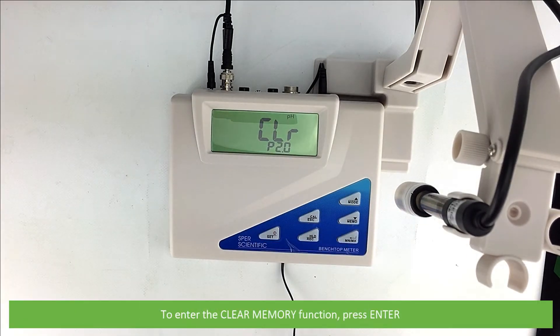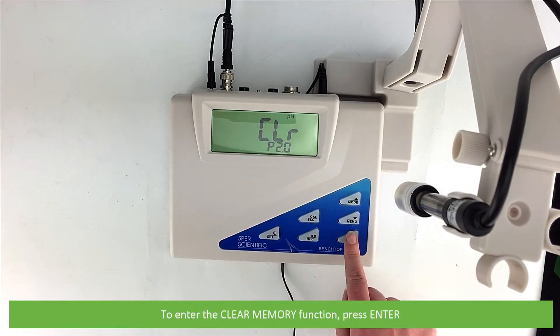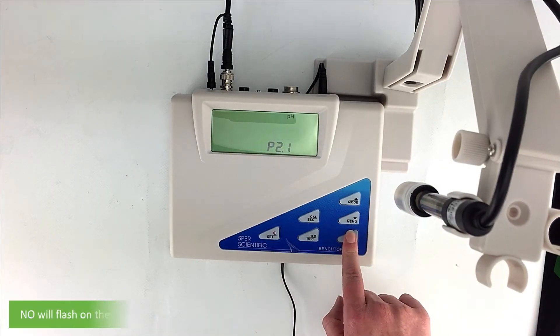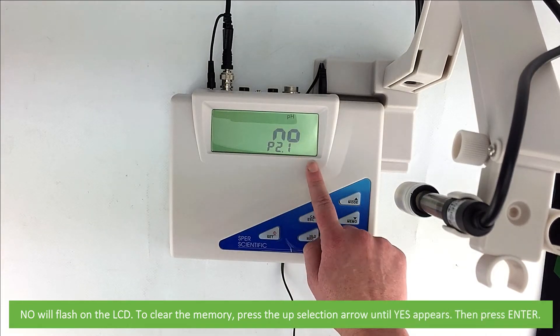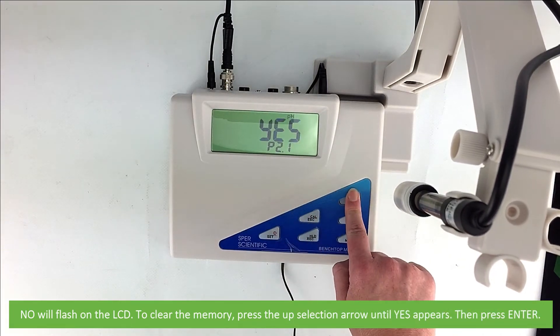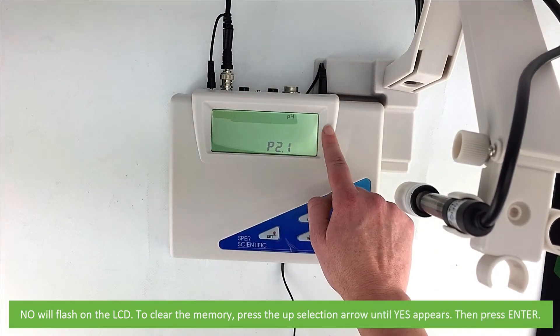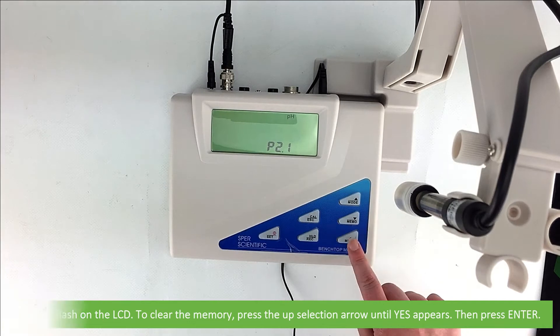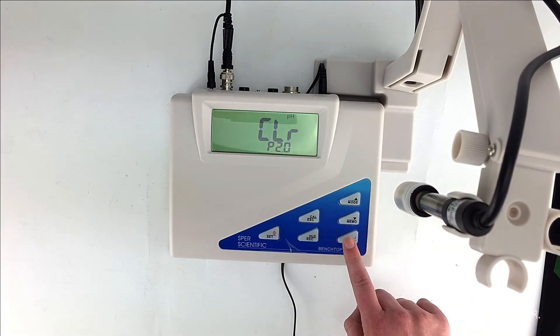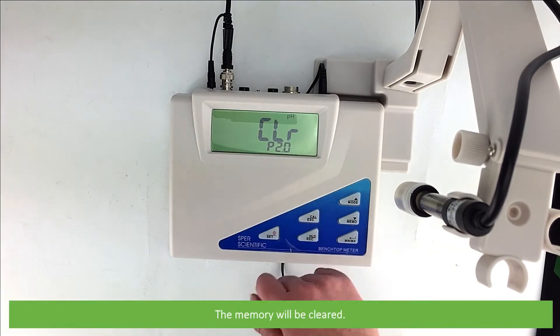To enter the clear memory function press enter. No will flash on the LCD. To clear the memory press the up selection arrow until yes appears. Then press enter. The memory will be cleared.